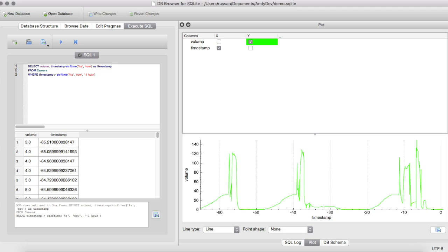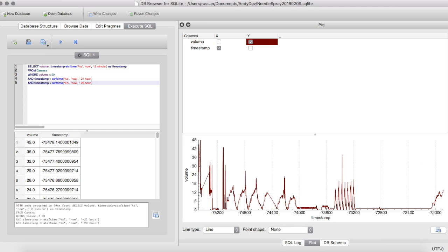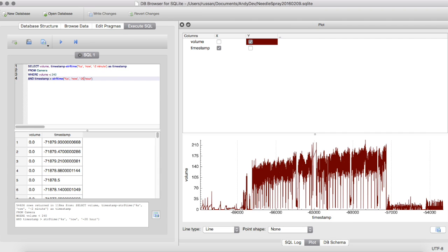This shows the SQLite database browser recording the data, and you can see where the droplet begins to grow, grows up to a fixed size, high voltage comes on, and it drops down in size. Of course, this data has just been taken during the development of the program, so it's not very consistent from plot to plot. You can see here where the control software has been looping for several hours, and data was collected automatically. Time hasn't yet been taken to experiment significantly using these tools.